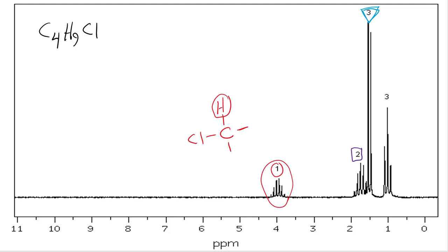But if we didn't know that, let's still recognize the fact that with 3 hydrogens, the simplest way to achieve that structurally would be to have a methyl group. And that can only be attached to 1 other carbon. We're assuming or speculating that it has 1 neighbor. But again, that may not be intuitively obvious to us at this stage.